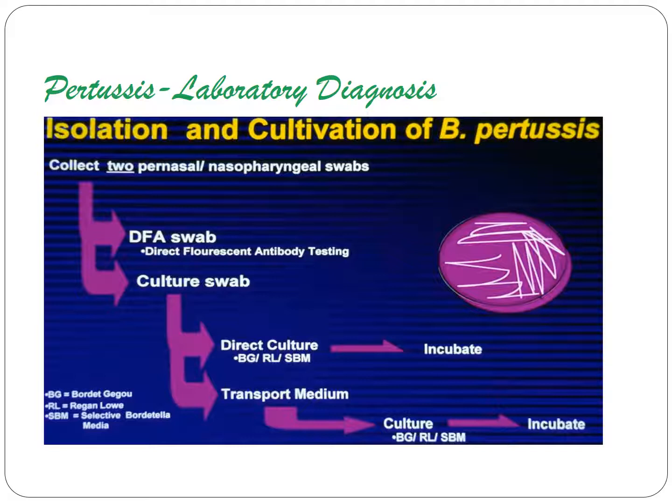So here you can see a schematic diagram of how isolation and cultivation of Bordetella pertussis may be done.